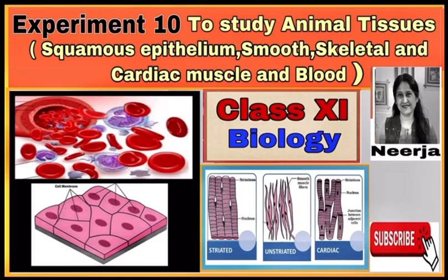Hello students, this is experiment number 10 to study animal tissues, squamous epithelium, smooth, skeletal and cardiac muscle and blood.